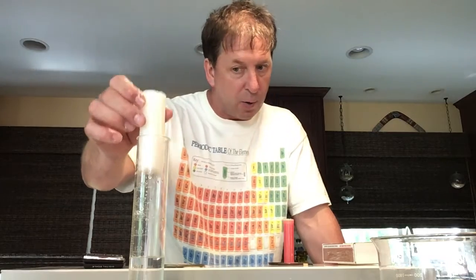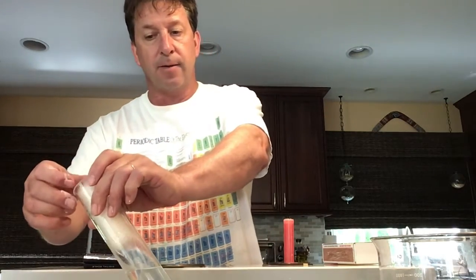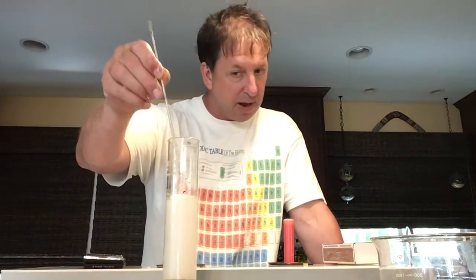We'll wait until this gets nice and hard. It's nice and hard. We'll go ahead, record our initial volume for our water. We'll put it in, okay? We'll see that, oh, this one floats as well. We'll push it down, okay, and record our new volume. Now again, with water displacement technique, it doesn't matter where you start. It just matters that you record the initial volume and the final volume afterwards, all right?